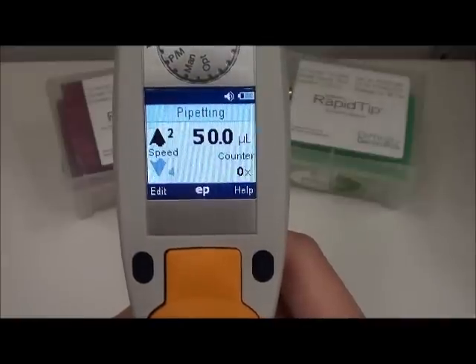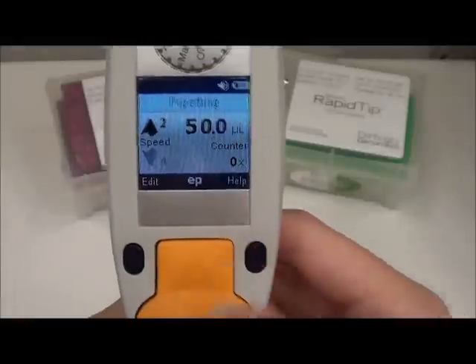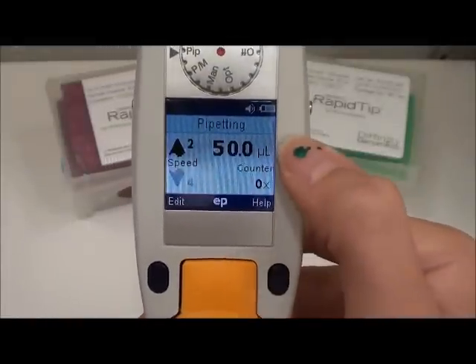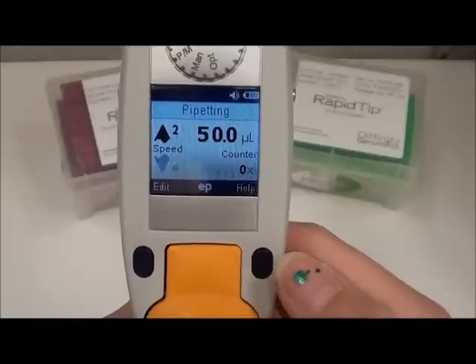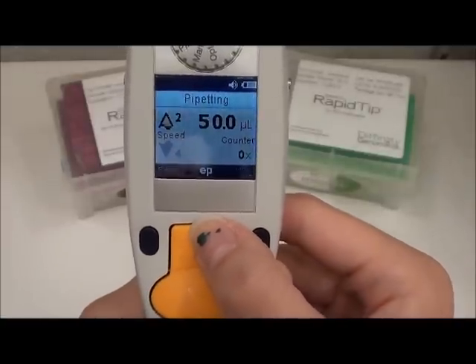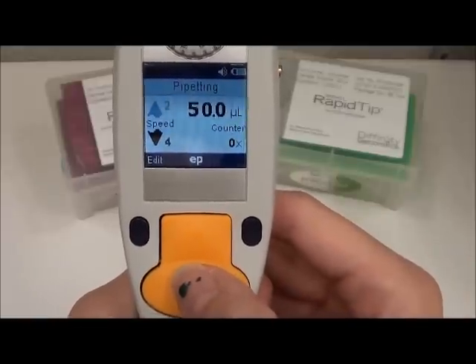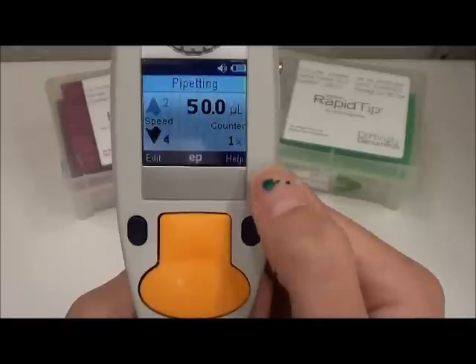With pipetting mode, you only need to hit each button once — you don't need to hold it for it to aspirate or dispense the whole 50 microliter volume. So we'll see what that looks like right now: you hit up and it goes all the way to 50, and then you hit down and it dispenses the full volume.